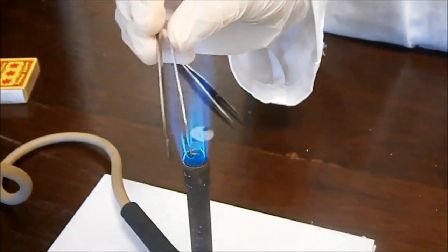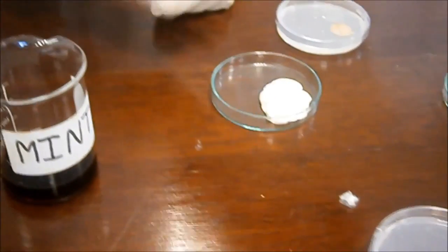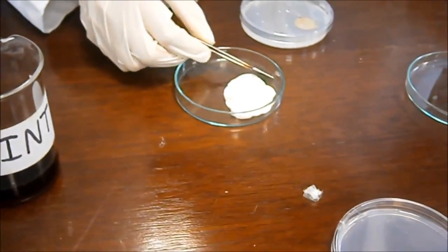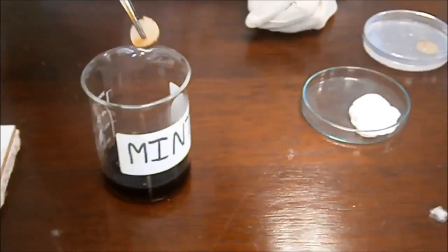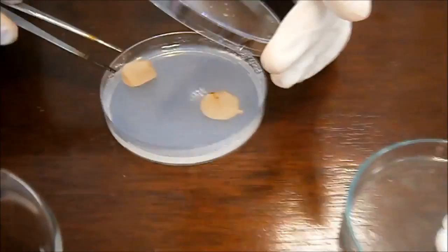A pair of forceps are placed in a Bunsen burner flame in order to decontaminate them. These are then used to pick the filter papers, dip them in the herb or spice extract, and then place them on the agar jelly in the petri dishes. Each petri dish is then closed, sealed, labelled, and placed in an incubator.